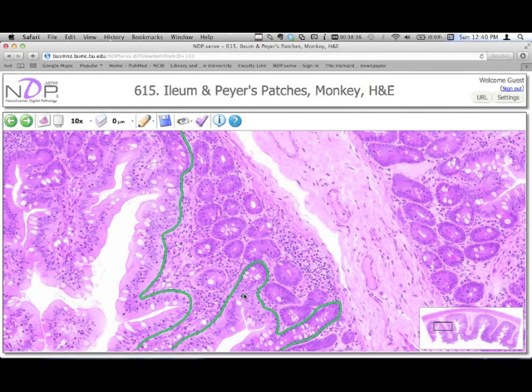And we see that here the cells are somewhat darker. And over here, as we go into the sheet towards the larger connective tissue spaces, these cells are somewhat darker. And so when we look again at our area here that contained our granules, first of all, it looks very similar to these cells and these cells, but it is not connected, as far as we can tell, to the lumen. Well, actually it is. We just don't see the connection.